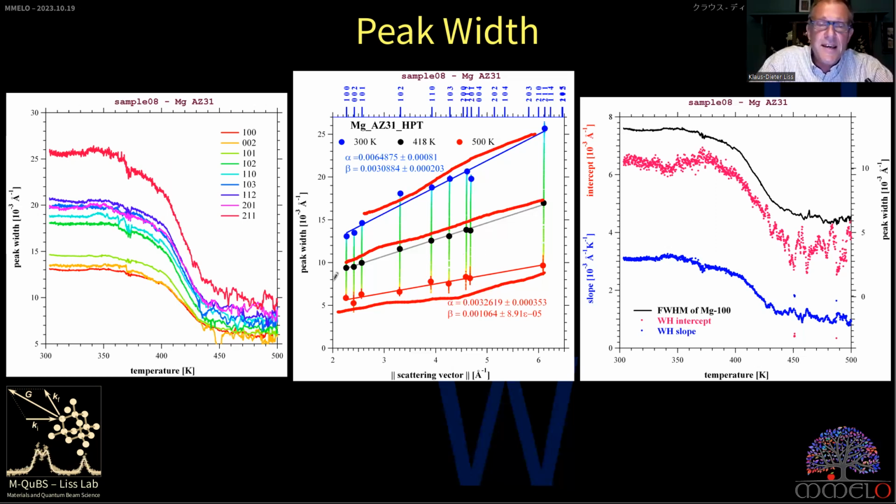But what we see here, the black ones, in the process of recrystallization, are aligned much better onto a straight line than the blue ones, the initial or final state. This is because recrystallized grains are free of dislocations.